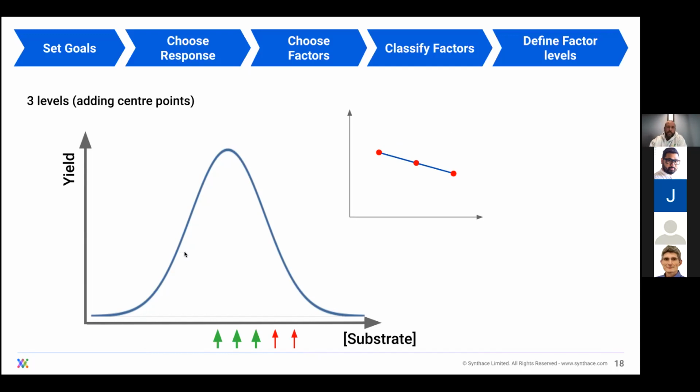This brings me to an important point that DOE works well when it is conducted as a series of sequential experiments. This lets you focus in on what's important at a minimal resource cost. For example, for a second iteration where we change the set points for substrate concentration, you would also likely drop some of the other experimental variables that showed no impact in the first iteration. You would set these unimportant factors as constants, and this would minimize the amount of runs required to evaluate the important factors, such as substrate concentration, in your second iteration.